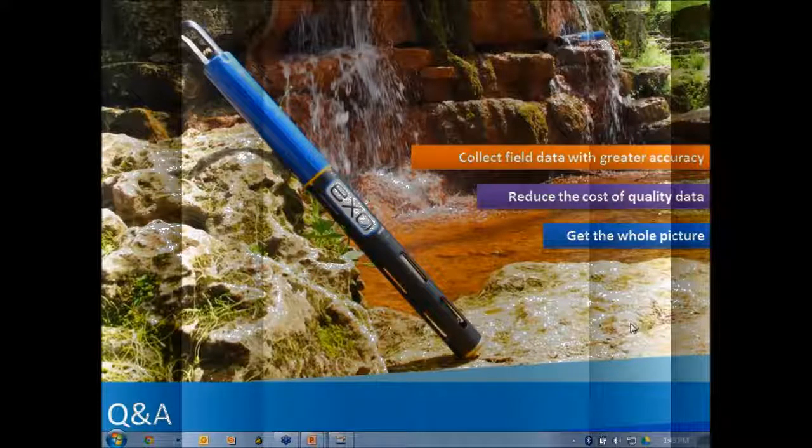But there's also cases in, say, a river system where several miles apart within the river system, you have very different species and different correlation coefficients that apply. A question came in about the windows. All of the windows are sapphire windows, so they're really smooth. They clean very well, and they're very difficult to scratch or change.